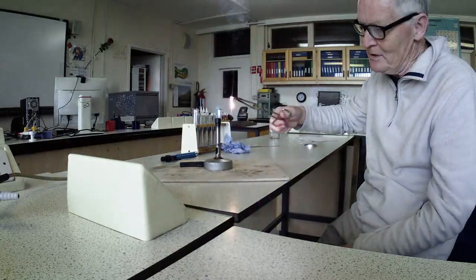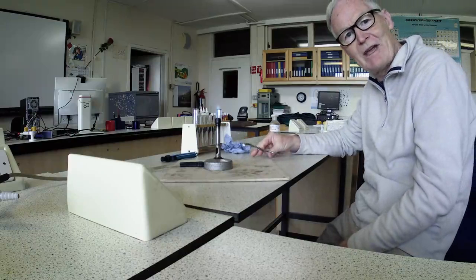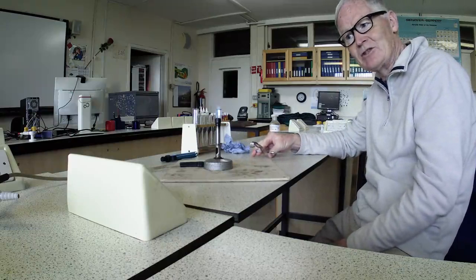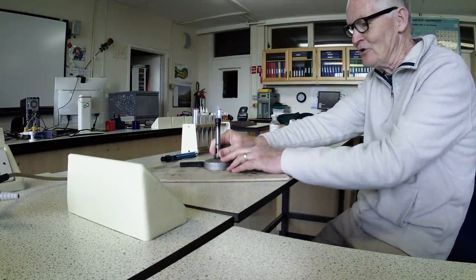So this experiment is giving off both heat and light, which are forms of energy. So you get an energy change in a chemical reaction. Calm down, George.